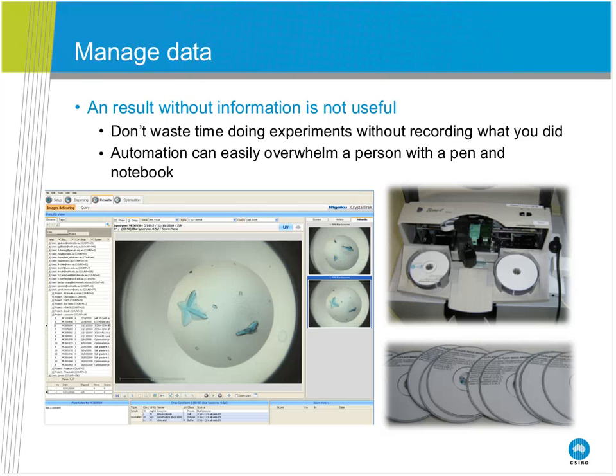But after the inspection cycle has finished, the images get burnt to a DVD along with the chemical information, and we present a viewer, which means that you can get to that information very trivially. And then we burn 2 copies of this, 1 copy that we keep, 1 copy which we give to our users, so that the users then are the primary holders of their data.